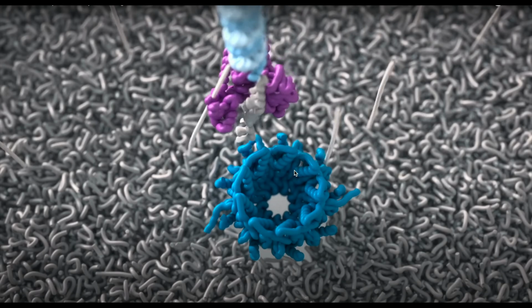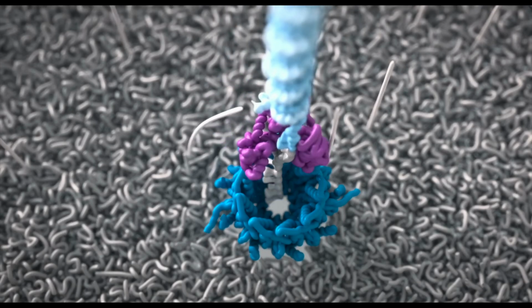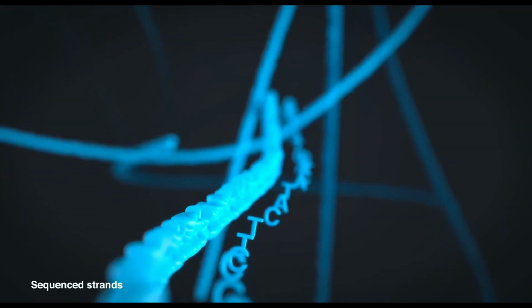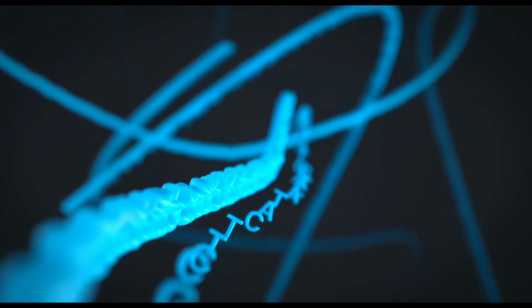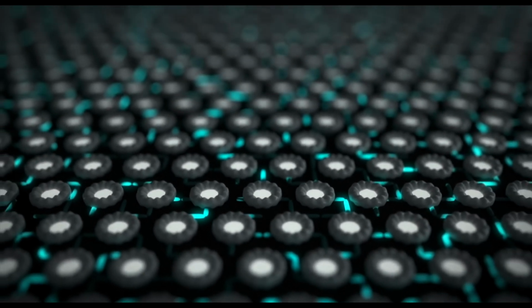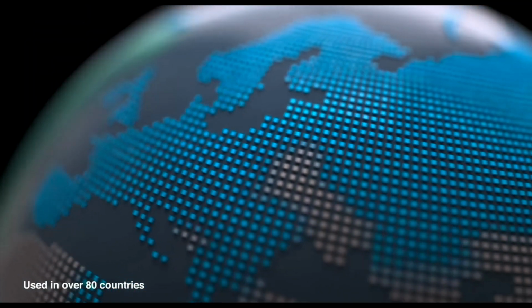As each nucleotide, A, T, C, or G, moves through the nanopore, it temporarily disrupts the ionic current running through the pore. These disruptions are recorded as electric signals, with each nucleotide causing a unique change in the current. The software decodes these signals and determines the sequence of RNA or DNA.